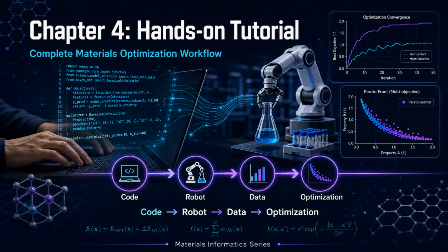Welcome to Chapter 4 of the NIMO Introduction series. This is the hands-on tutorial where we'll put everything together and run a complete materials optimization workflow from start to finish. You'll learn how to create candidate files, run multiple optimization cycles, and visualize your results. By the end of this chapter, you'll be ready to apply NIMO to your own materials discovery projects.